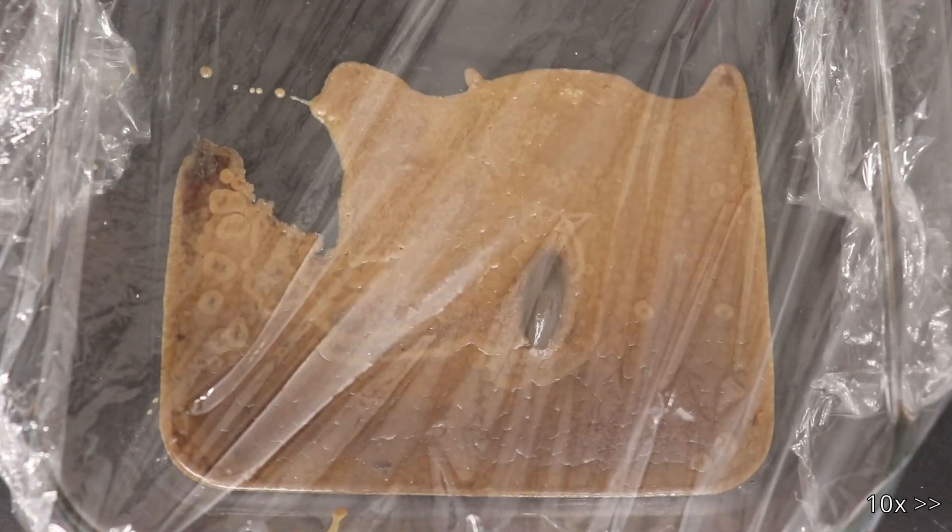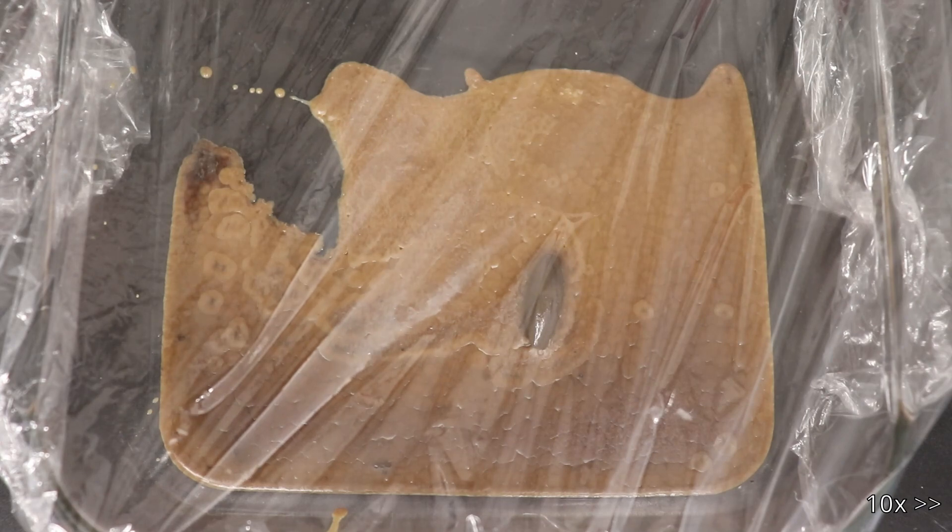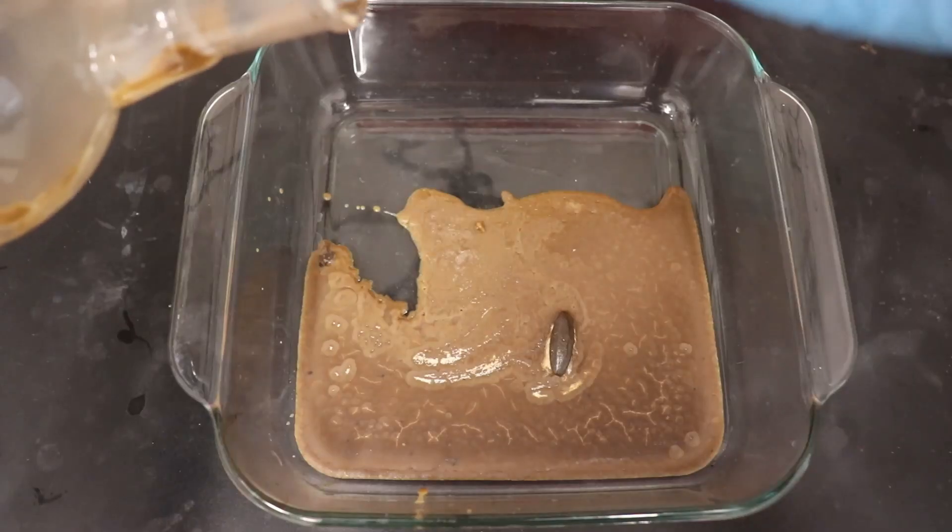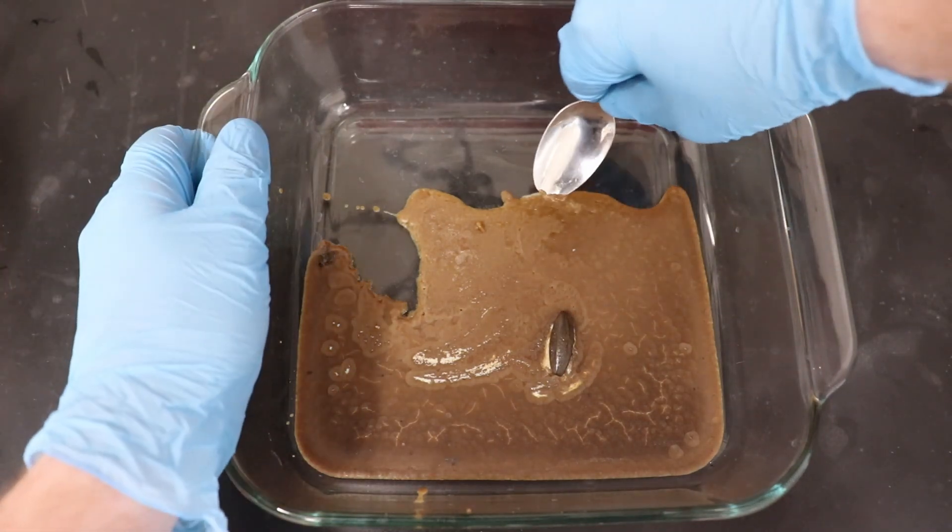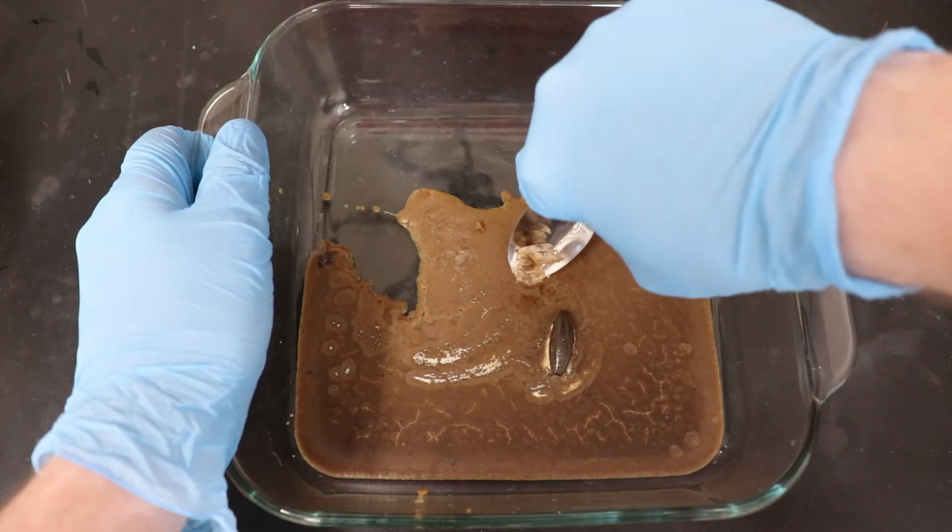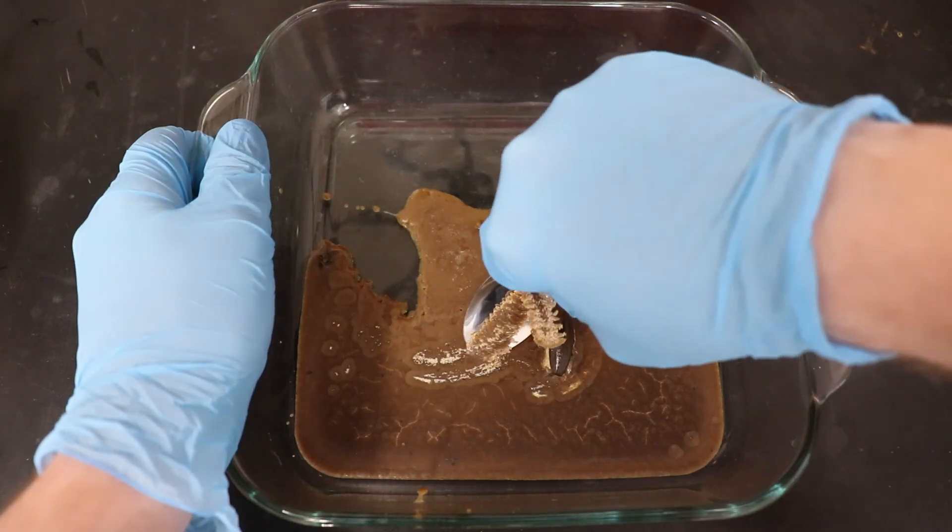Once cooled, the burnt-smelling caramel-like tar was scraped up into a blender to be mixed with 50 grams of calcium oxide. This mixing is slightly exothermic and forms a paste reeking of morpholine.